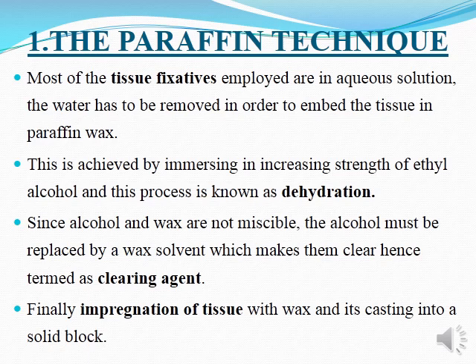Since the alcohol and wax are not miscible, the alcohol must be replaced by a wax solvent which makes them clear, hence termed a clearing agent. Finally, impregnation of the tissue with wax and its casting into a solid block.